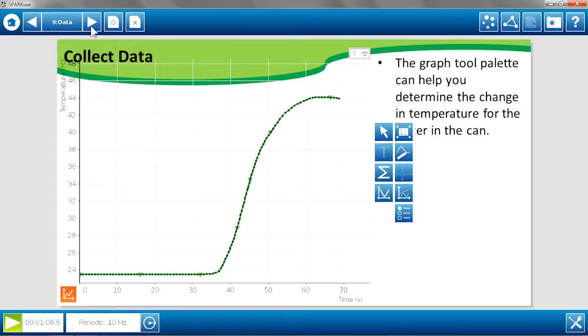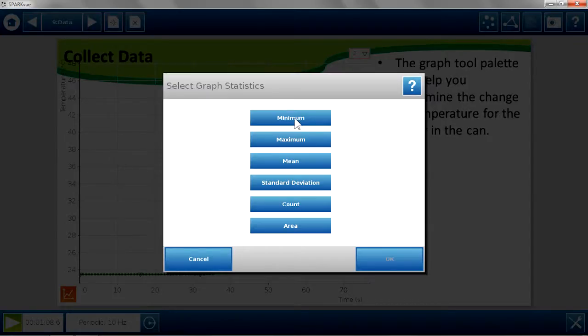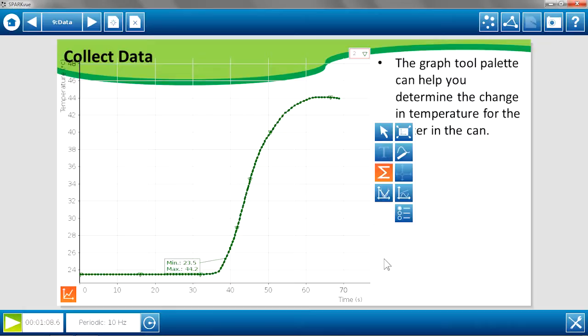So we've collected information on the mass before and after. Now we're going to look at the change in temperature of the water based on the energy that that food released. Our statistics tools of minimum and maximum be an easy way to find the difference in temperature. And that difference in temperature will be entered into a data table on the next page.